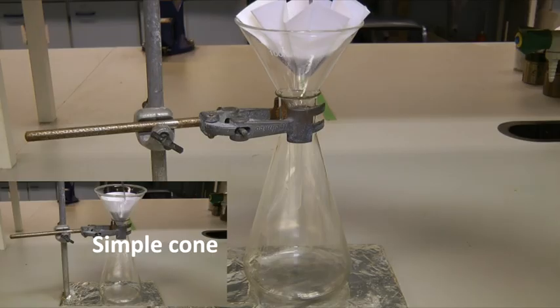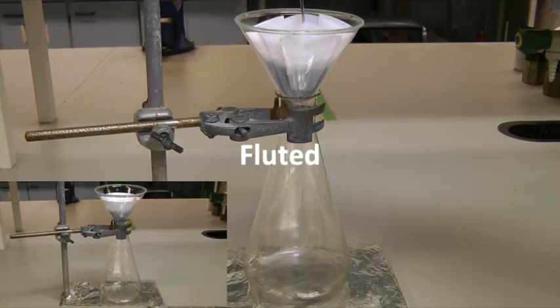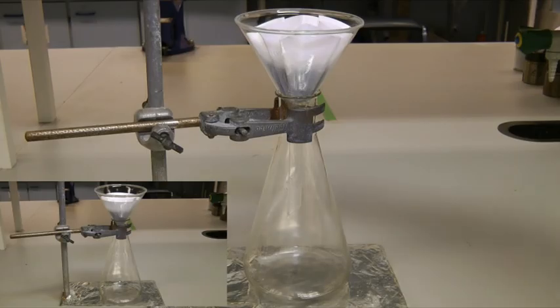A fluted filter paper gives the best results, with a large surface area available for filtration and less chance for the filter paper to be blocked by particles of solid.